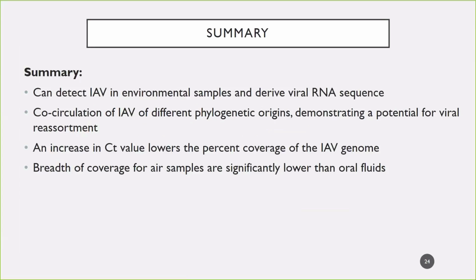So in summary, we did see that we can detect influenza A virus in our environmental samples as well as derived viral RNA sequence, and that the co-circulation of the different influenza A viruses demonstrates a potential for viral reassortment. The increase in CT value, which was seen in the environmental samples, shows a lower percent coverage of the influenza A virus genome. And you can see that the breadth of coverage for the air samples is significantly lower than the oral fluids. So although air samples may not be a standalone method for surveillance, they may be used as a complementary method to environmental surface swabs as well. Next slide.